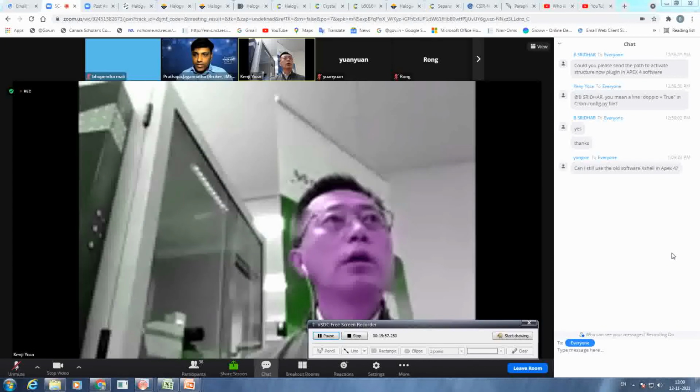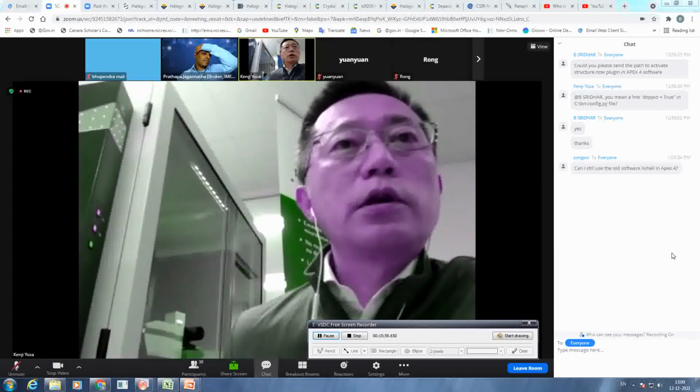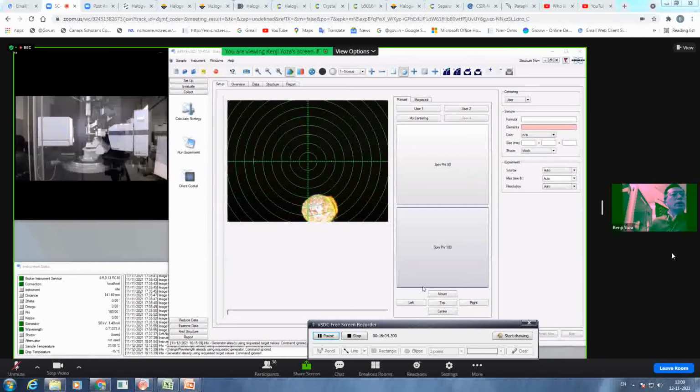Okay. Thanks. I will share my desktop. Can you see my desktop? Yeah, I can see.